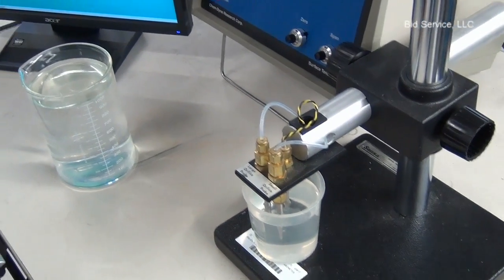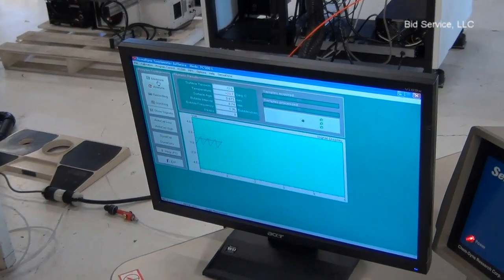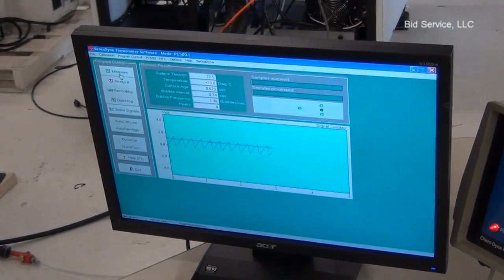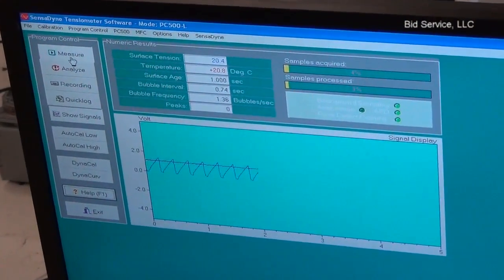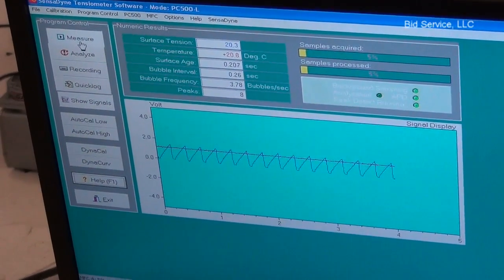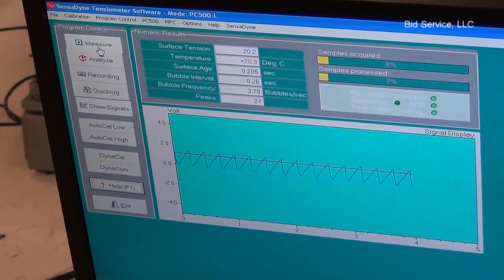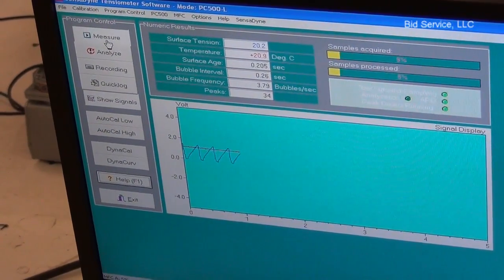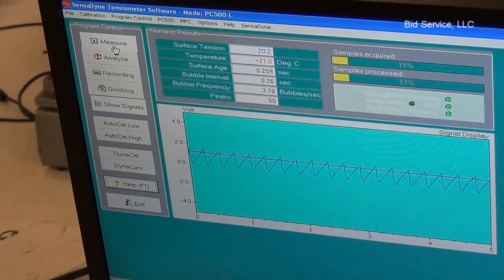Again over here we'll just do another measure, and with isopropyl alcohol we're getting a surface tension of 20.2. So you see the surface tension is different — the difference between the water and the isopropyl alcohol.